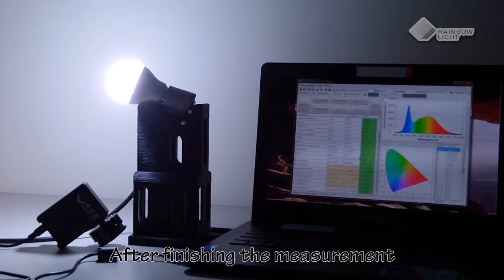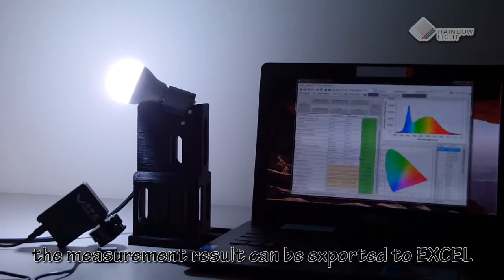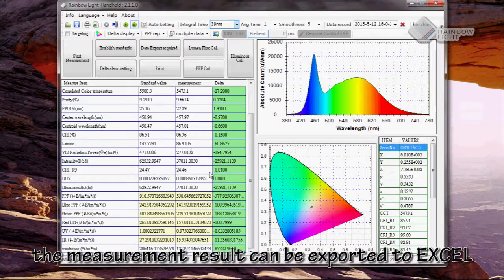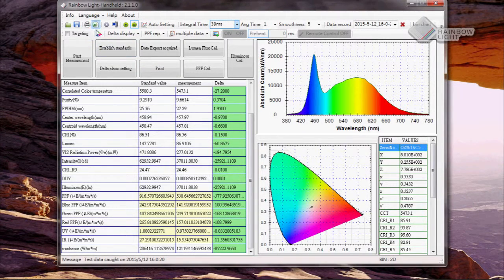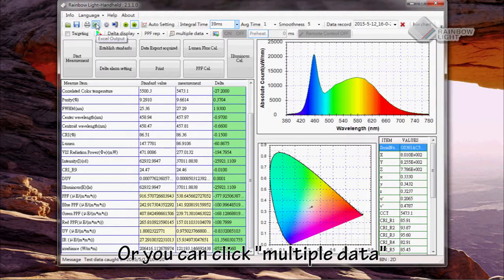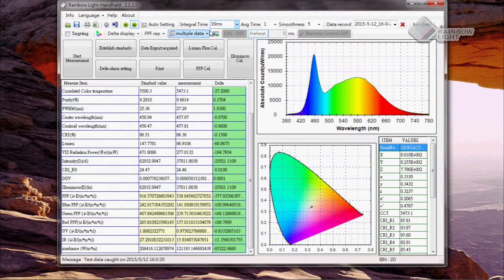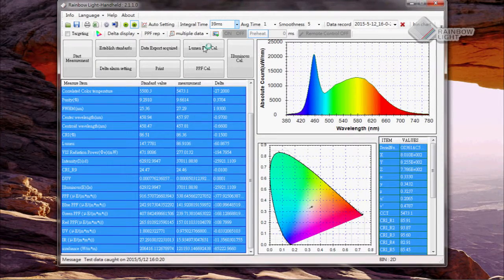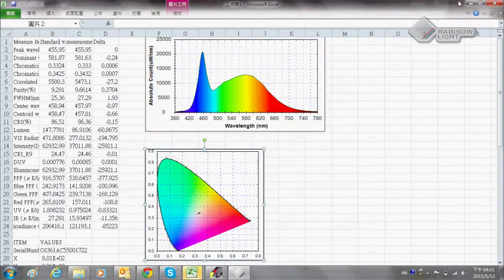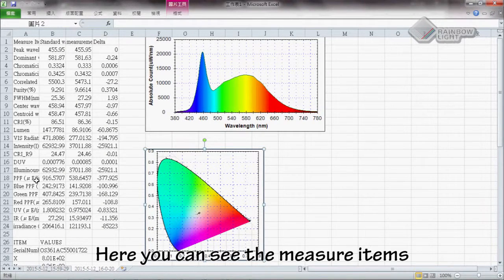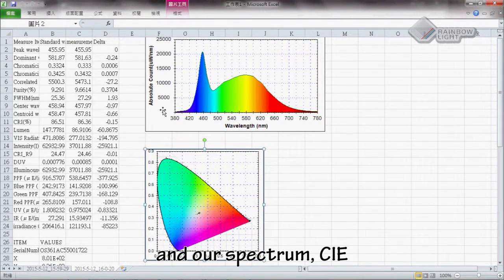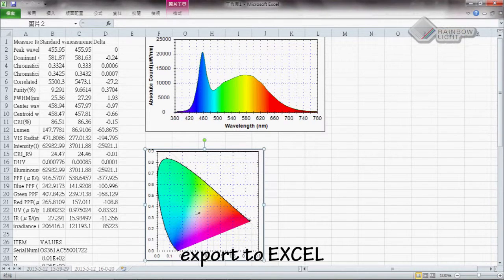After finishing the measurement, the measurement result can be exported to Excel. Or you can click multiple data to export all the data and pictures to Excel. Here you can see the measurement items, spectrum, and CIE exported to Excel.